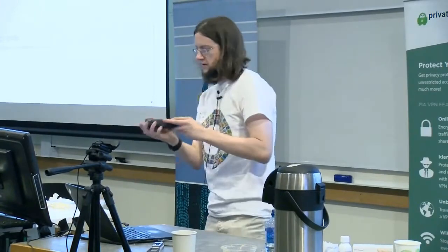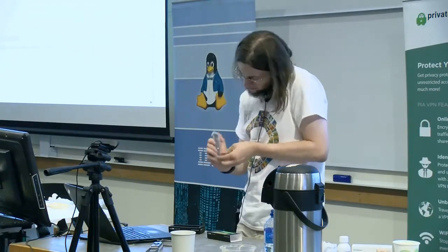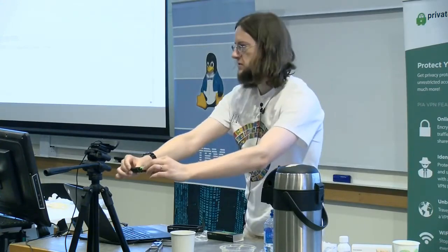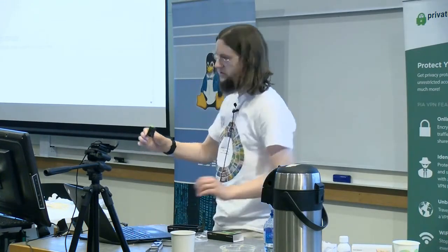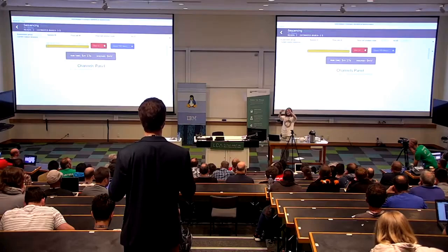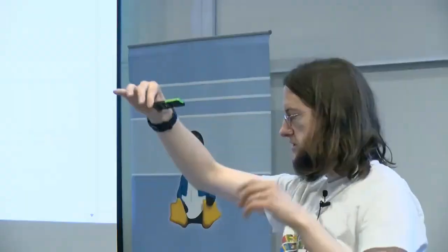So the sequencer itself, we have these, got another one here. We have these, this is, oh, sorry, I've killed my webcam software. This is the tiny thing that does the business of the sequencing. So that goes into the sequencing device.